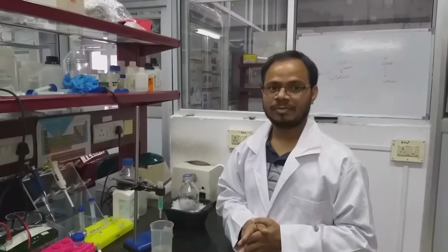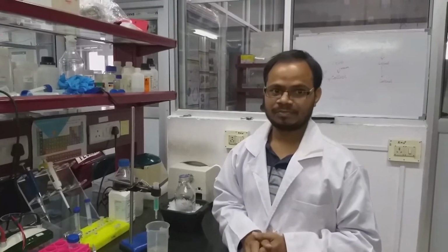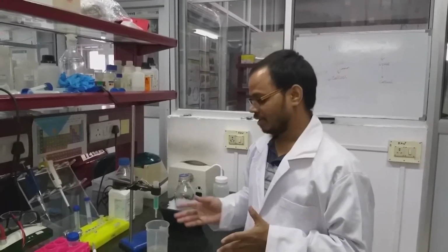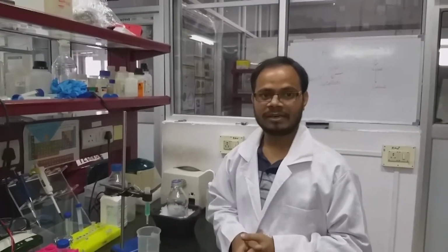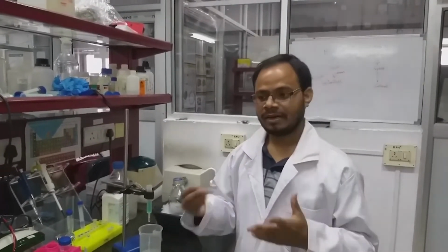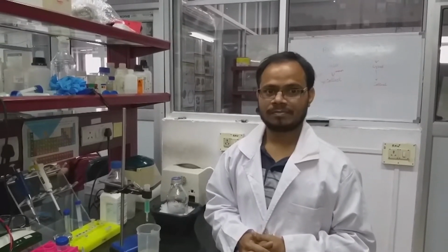So we will keep in this condition at least 20 minutes to charge the beads. After that we will remove the nickel NTA, elute the nickel solution and then equilibrate with the lysis buffer.